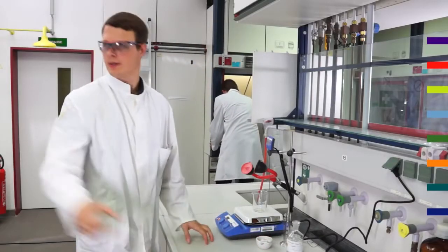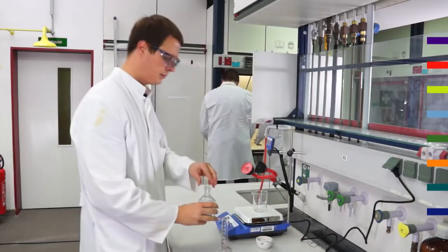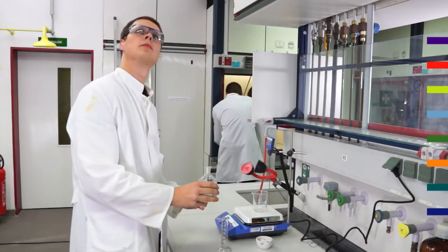I'll go and get some concentrated hydrochloric acid. Smithy, wear gloves in case you spill something.